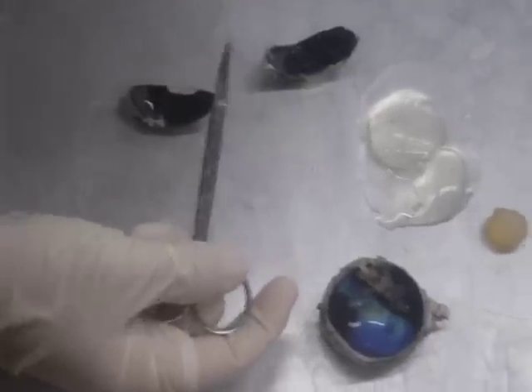Hi there, everybody. We are dissecting a cow eyeball in vertebrate anatomy class, and we're going to go over all the parts.